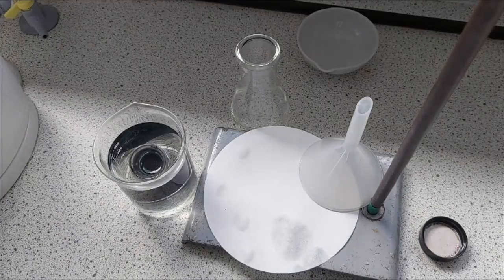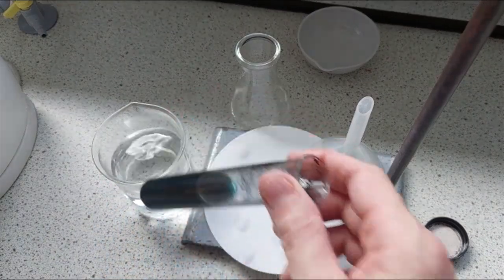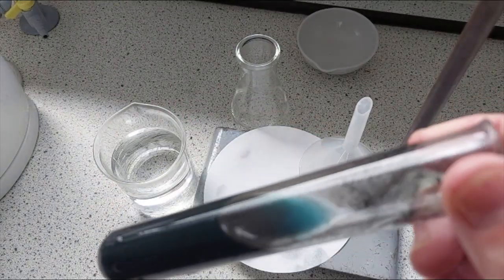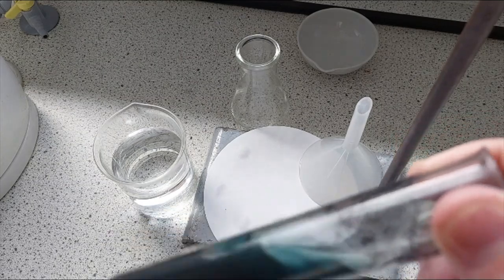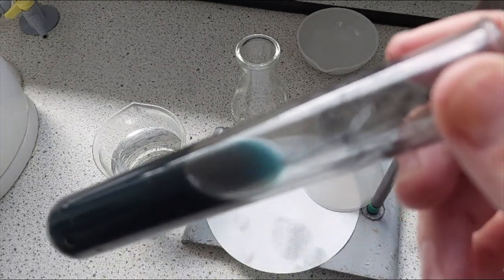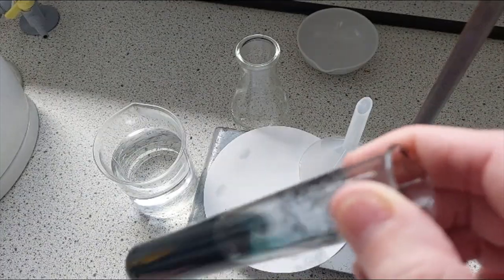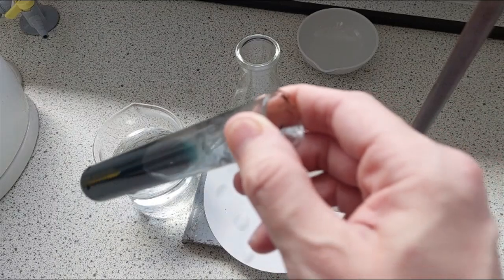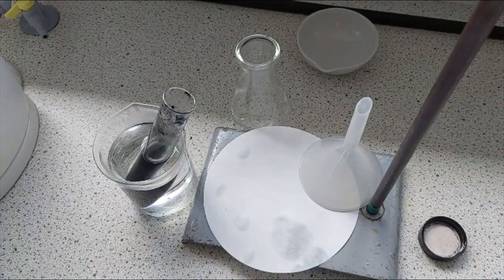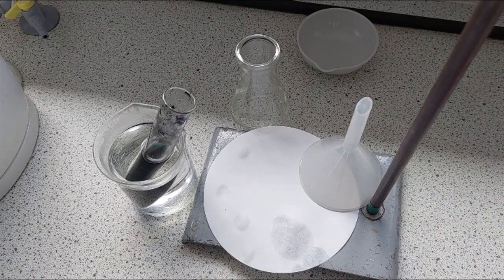Now I'm up to my 6th spatula of copper oxide powder, and as you can see, it does not seem to be dissolving anymore. It's no longer reacting. There is still the blue color you can see in the background there, but the copper oxide powder that remains in this liquid is insoluble, and so it's just floating around inside there. It's not reacting, it's not turning into that lovely blue color. So what we'll do is we'll move on to the filtration.